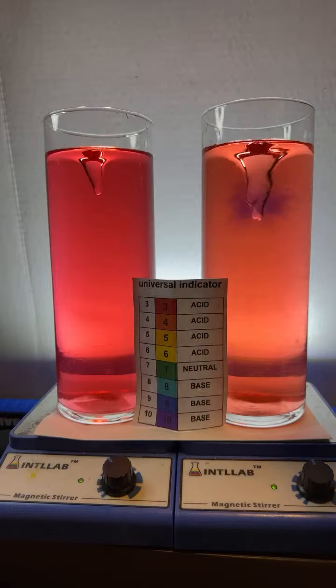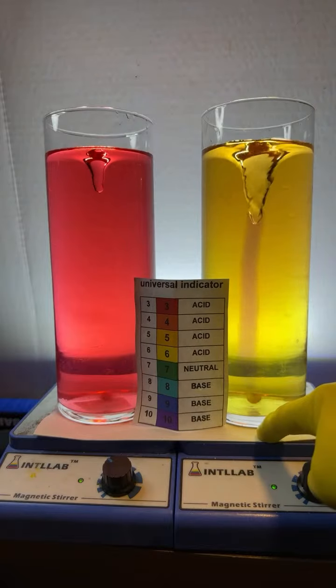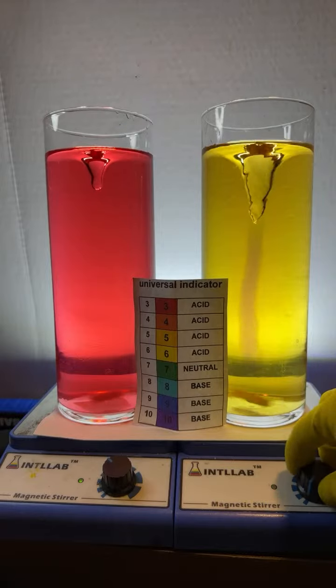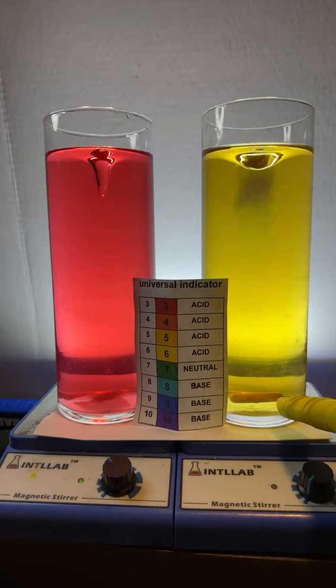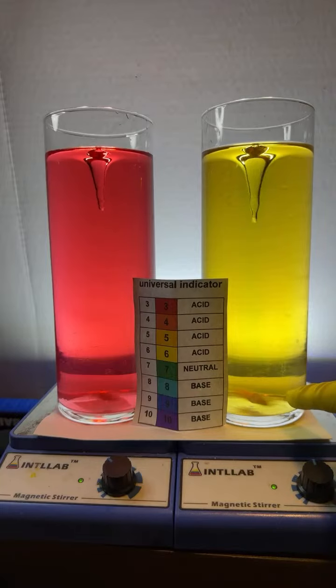Think of these things here at the bottom as magnetic fans with magnetic fan blades inside them. And then here, if I turn it off, there's a magnet right there. It's just a little stir bar. And if I turn the magnetic fan blades on, it turns a stir bar.